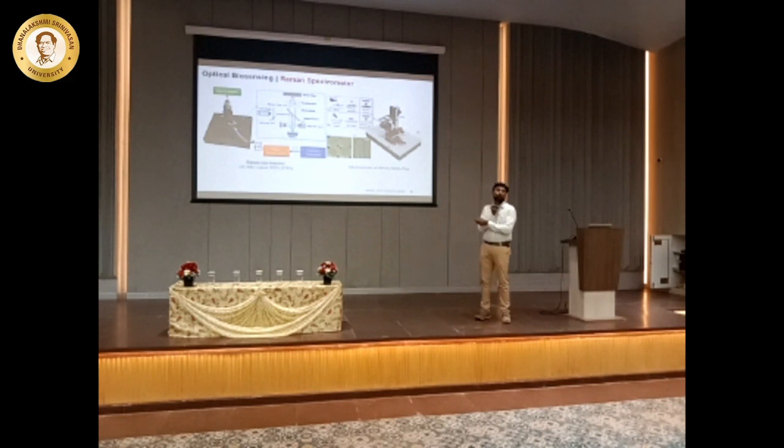You need to know some electronics and where it is going to apply. I'm not going to go into more detail; you can look at this paper for more information. I want to bring out that this FT Raman spectrometer using an optical pickup unit can be used as a diagnostic technique even in hospitals. It's going to be very low cost.